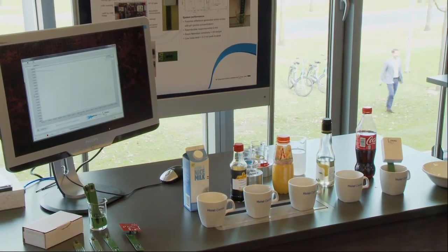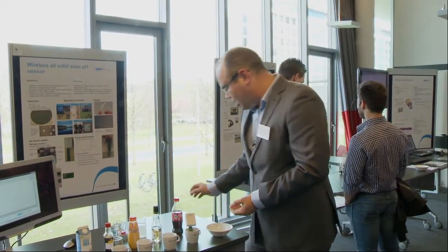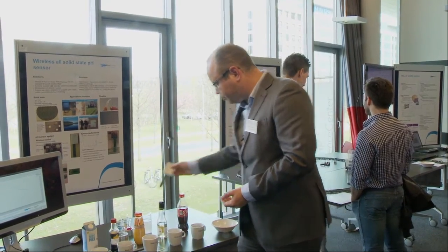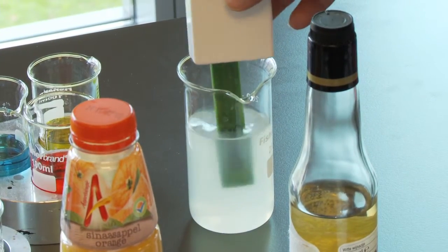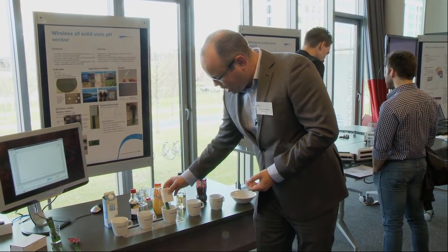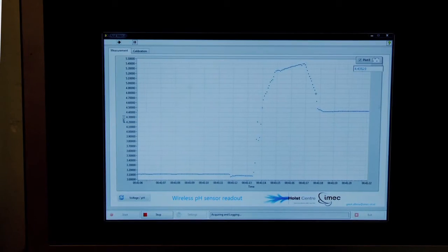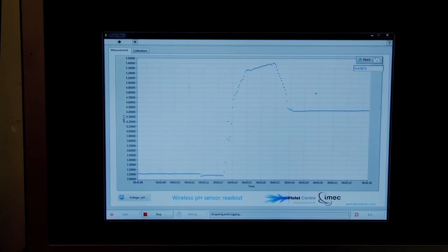It also demonstrates the fast response time of the sensor. You only have to rinse it, and now I immerse it in orange juice, and already within a few seconds it has its final pH value.